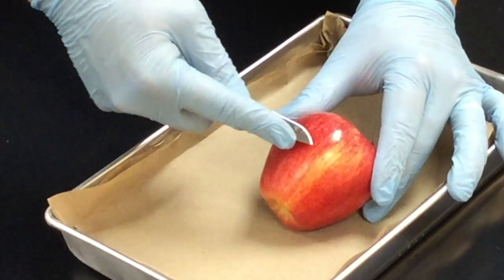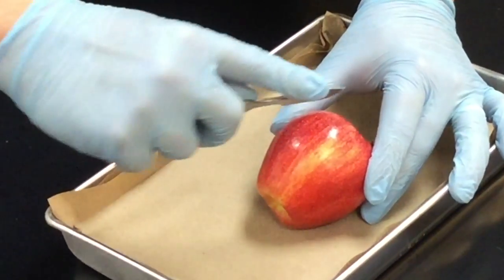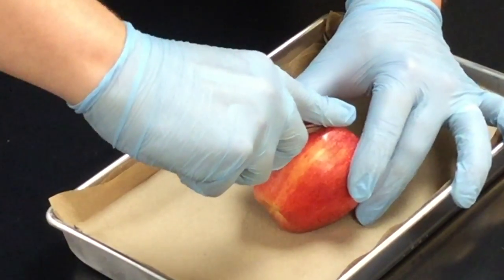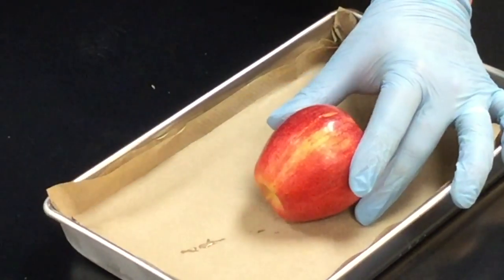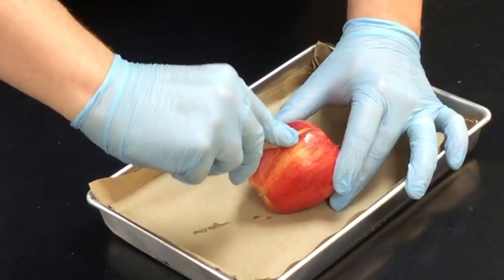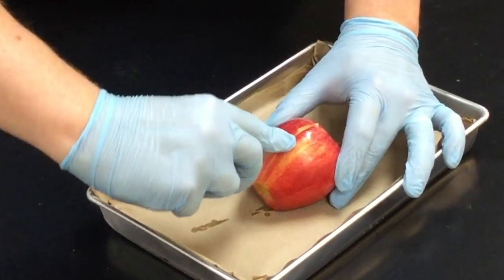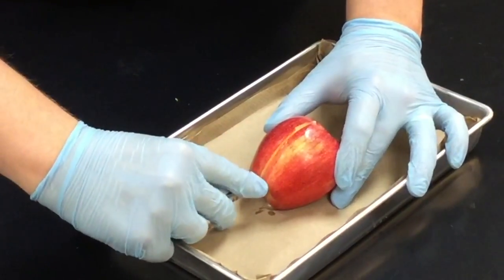specimen. Now, if you see where your first incision is going to be, we want to make this incision larger. The way that we're going to do this is let your blade rest within that cut and gently push down deeper into the specimen to further separate it. So always make sure you hold onto that flat end. Now this is going to be until you can get all the way through. And this is the exact same type of cutting action that we are going to do with the brain.